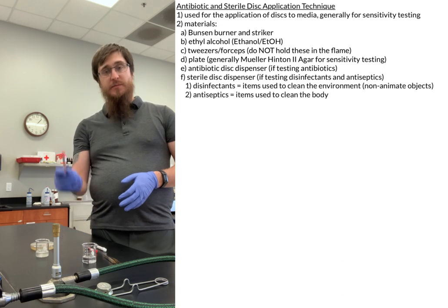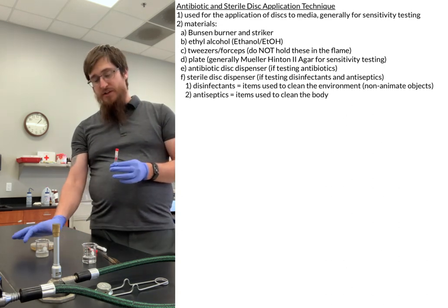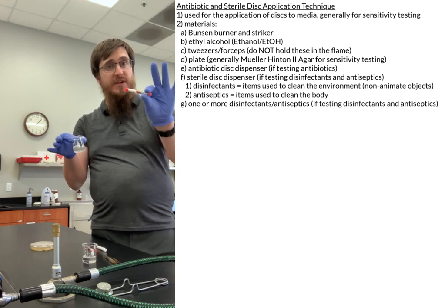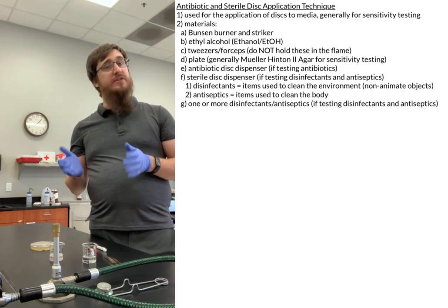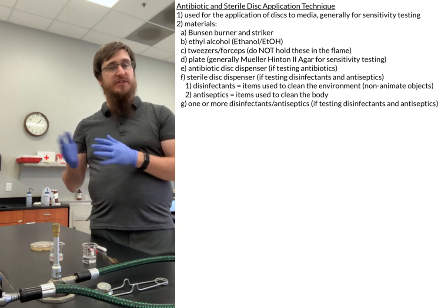And that's where we end up with these little guys here, which are our sterile discs. And then you will need some kind of antiseptic or disinfectant. I happen to have some bleach here, and that's what we're going to be dipping into in order to get it on the disc. So those are the basic materials that you're going to need to do this on either the antibiotic side or the disinfectant antiseptic side.